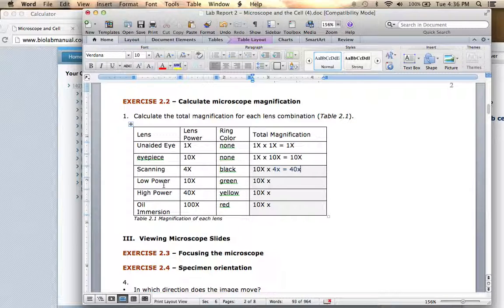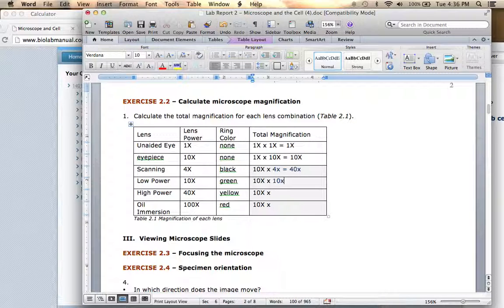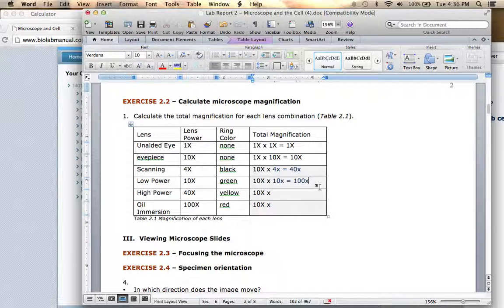Another example is the low power lens — it has a 10x magnification, so you multiply the eyepiece magnification of 10x times the low power lens magnification of 10x to give you a total of 100x magnification when you're looking through that lens.